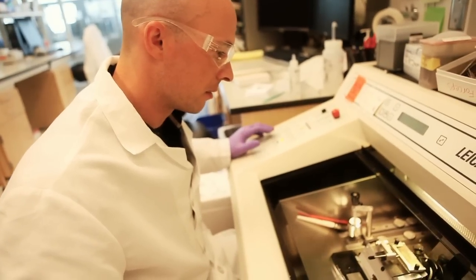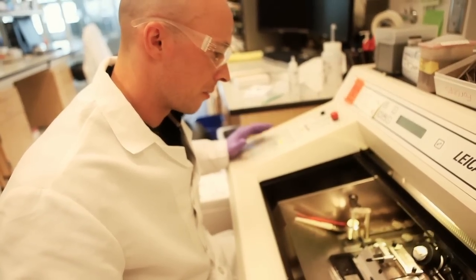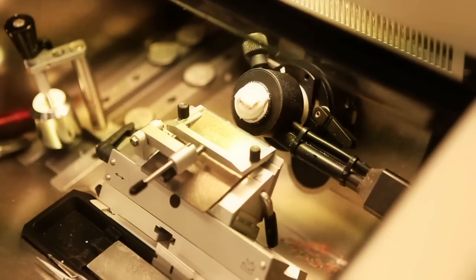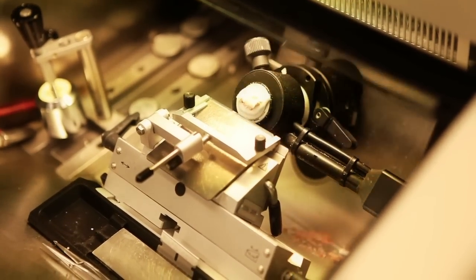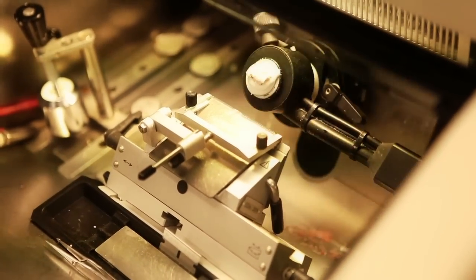This is Clint Chock, a research associate in the Broad's Biological Samples platform. And this is a sample, a piece of tissue from a patient with lung cancer.